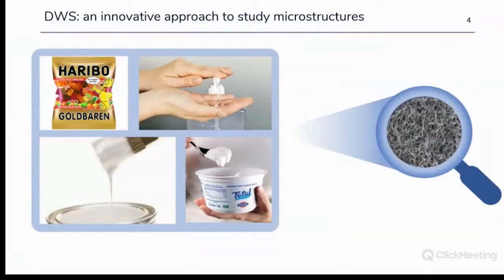If we take, instead, the example of the soap, we know that customers enjoy products that have a very good texture in their hands, and they are thick. But on the other hand, we don't want the soap to be too thick, too difficult to spread on the hands.